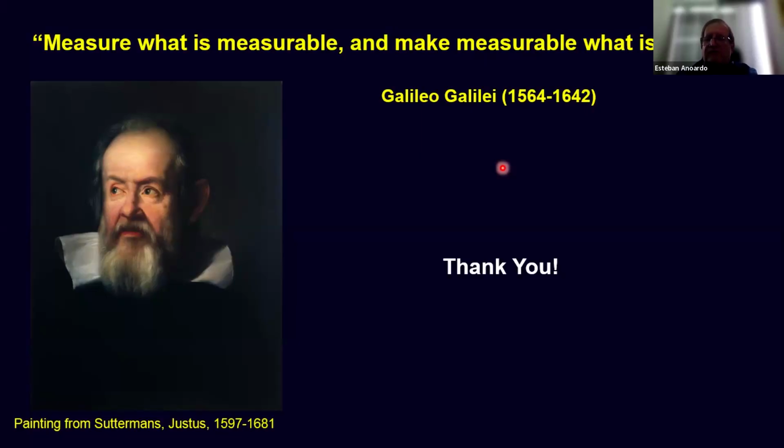So now, how do you give access to the machine to someone that is just a beginner, entering into the technique? So you need some software that helps to interpret the data, okay? So once you have validated the models, and most of the models that are included in these tools are already validated from many years of work.